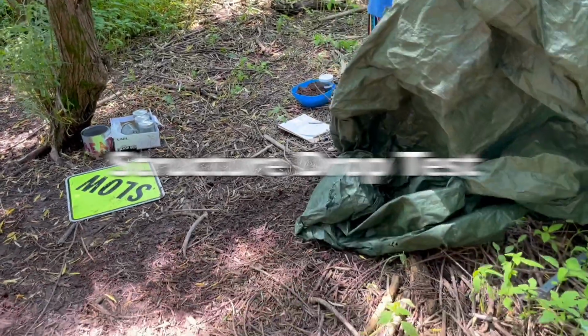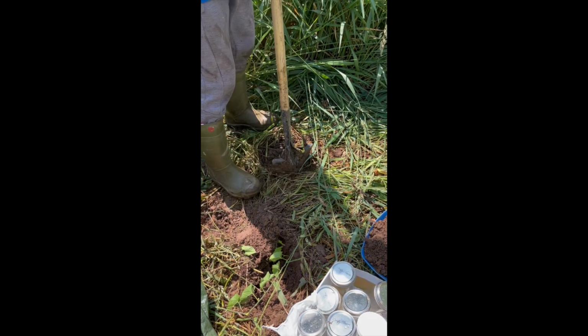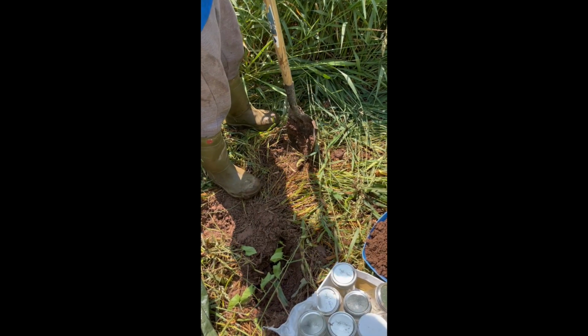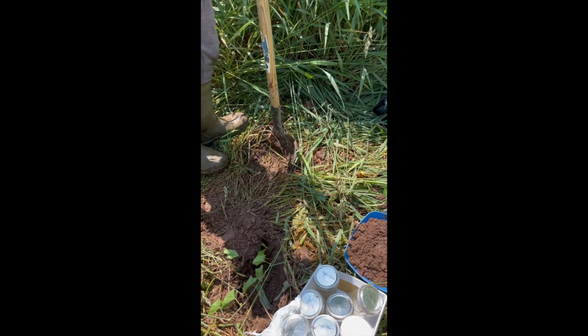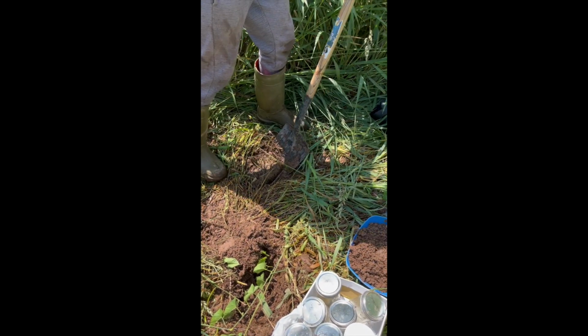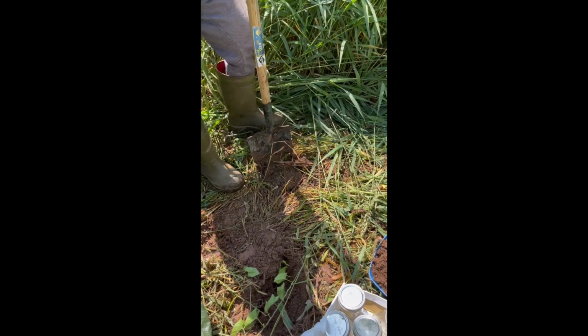Next is the Soil Structure Drop Test. This test is used to determine your soil structure and type. You will need a shovel, a meter stick, a tarp, a wooden board or hard flat surface, and your soil. Dig a hole that's 15 centimeters by 15 centimeters by 15 centimeters.